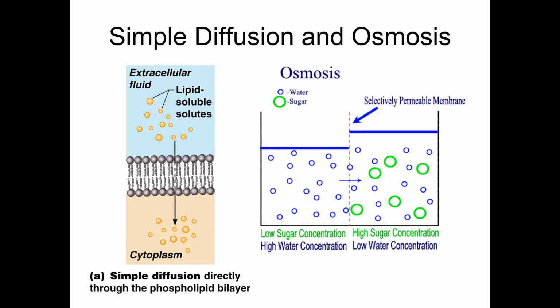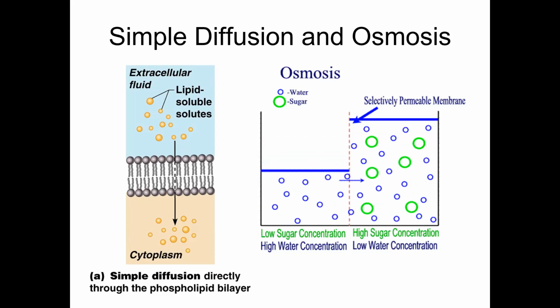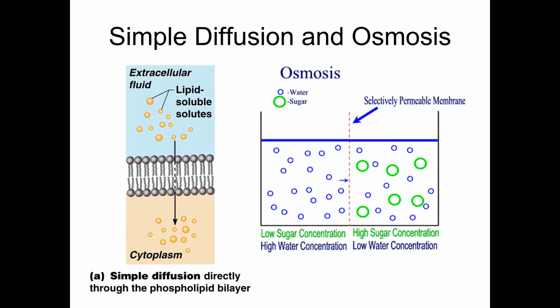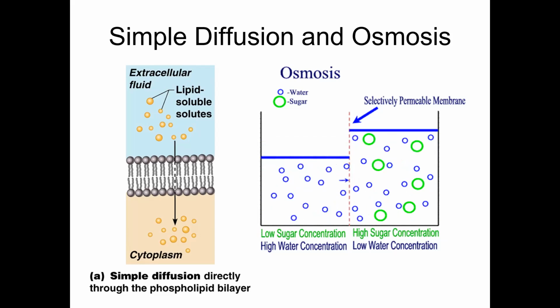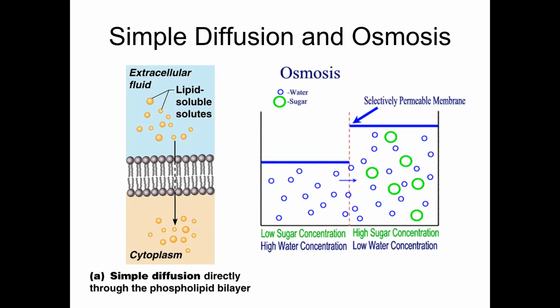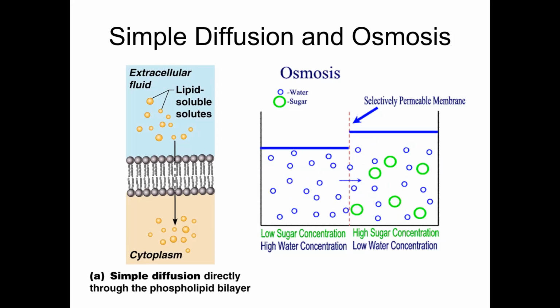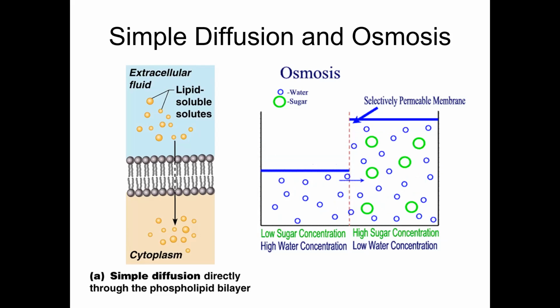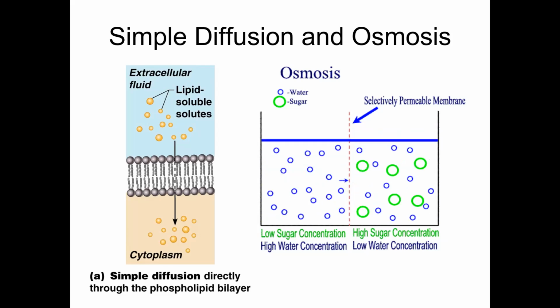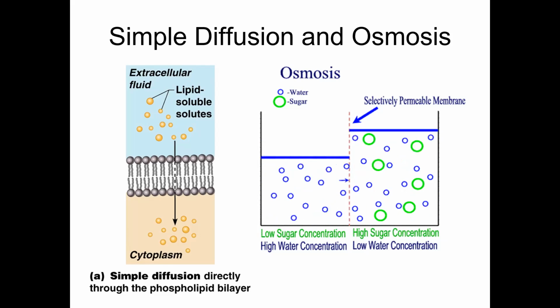Now, I've put an artificial cell in the distilled water, and inside the artificial cell, the cell contains 10% sodium chloride. Now, if osmosis works, water should go from the high water side into the lower water side.